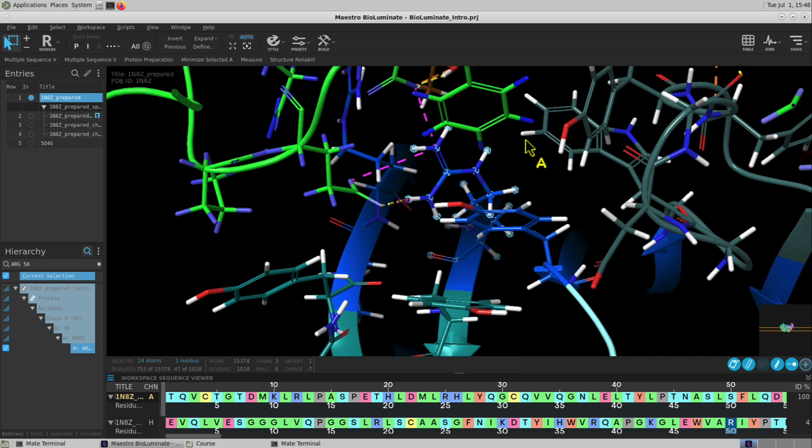In order to clean up the workspace, we are going to toggle off the measurement. Remember, toggling something off does not delete it, so we can toggle it back on and view it in the workspace at any later point. In this video, we went through using various workspace toggles, navigating the structure hierarchy, and taking a measurement in the workspace.